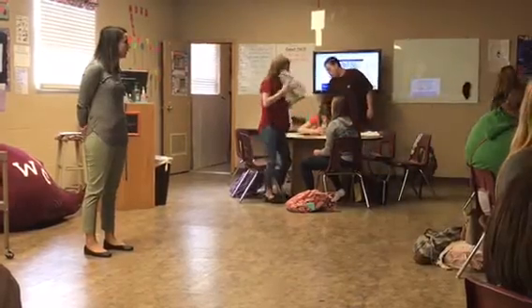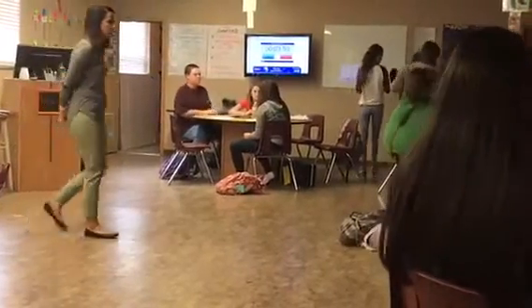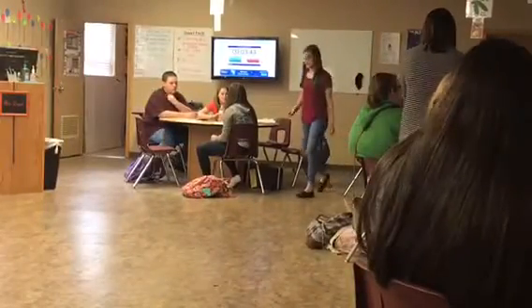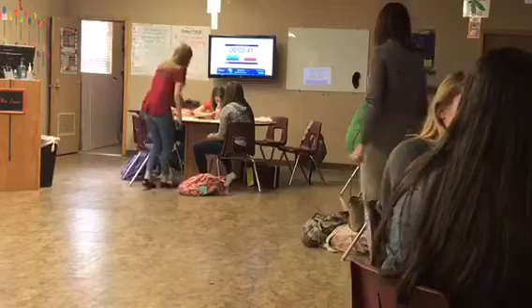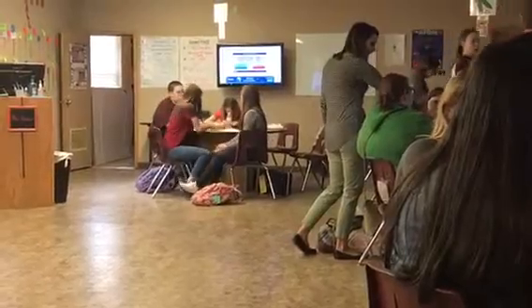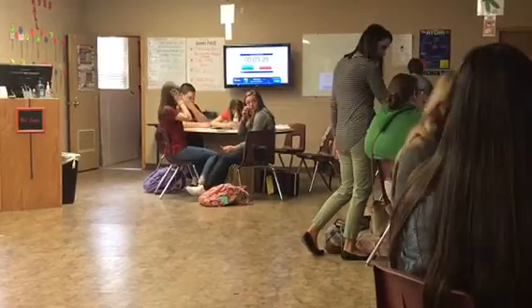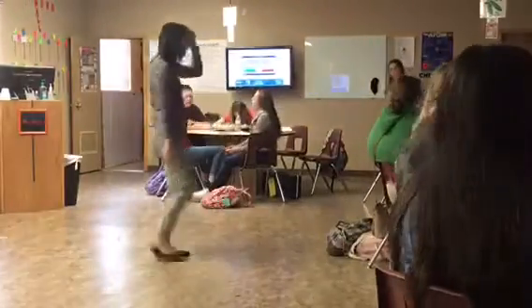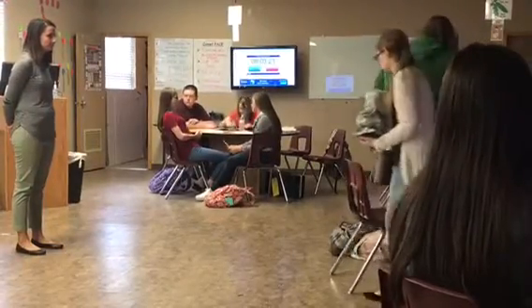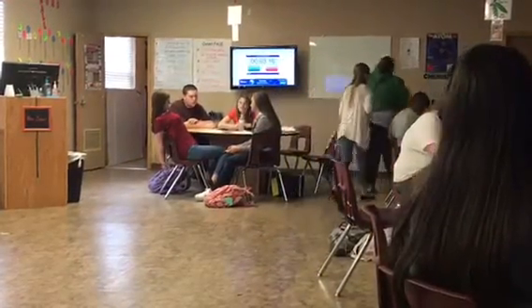Alright, table two, one person. It's just going to revolve, so in case you're looking at it the other way, just move this part over the microscope. Alright, table three. Be careful. Does yours not have a cover on it?